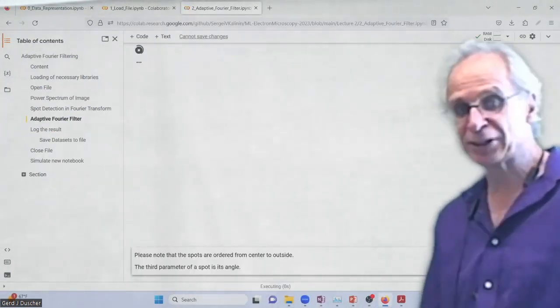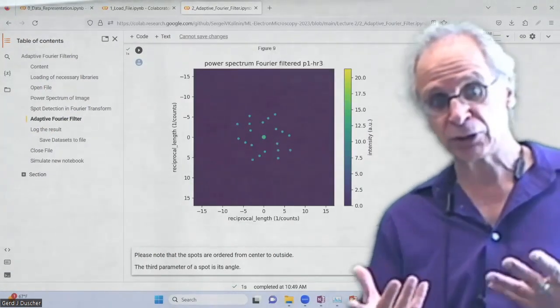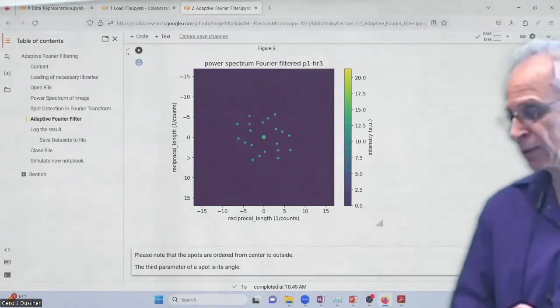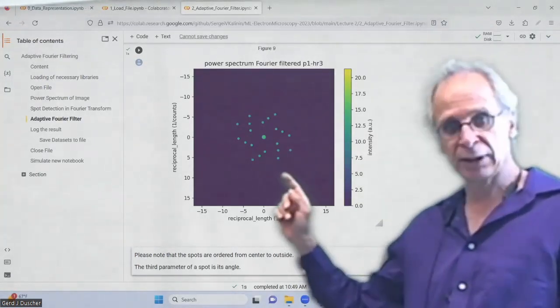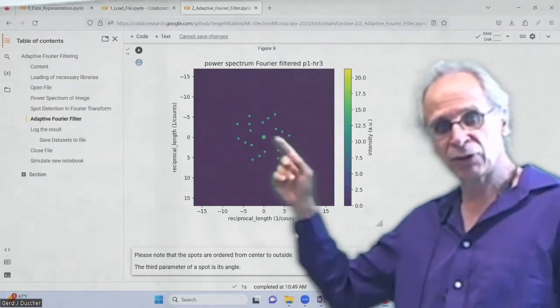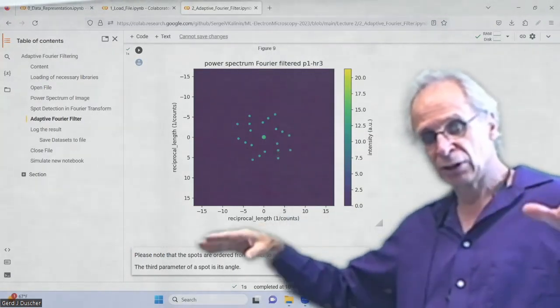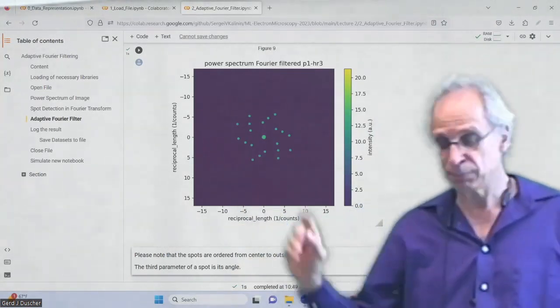And again, it's much easier to look at that in Fourier space. So looking in Fourier space at what you did and what you have gives you a very clear image here. So we used only very little of the low variation of the contrast, and the rest we threw away.